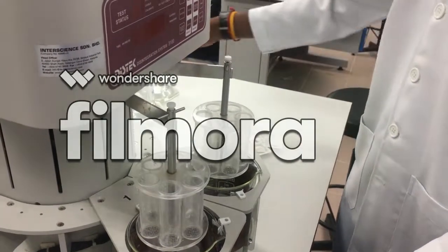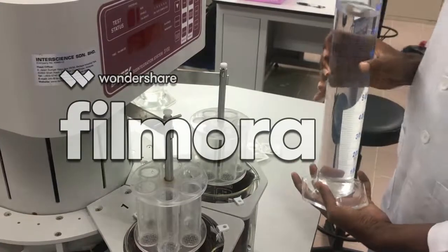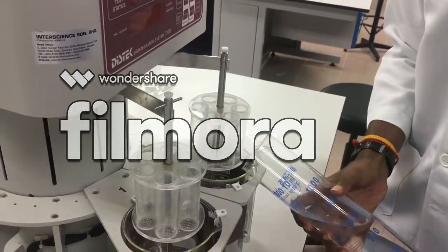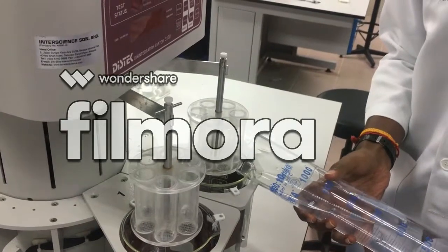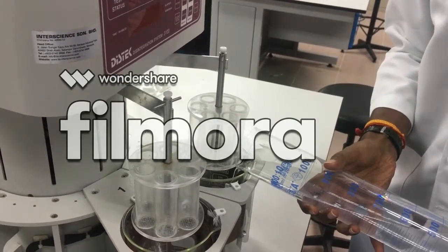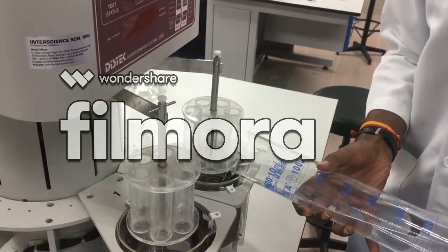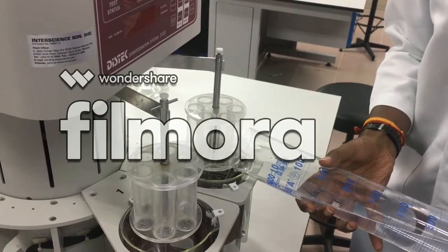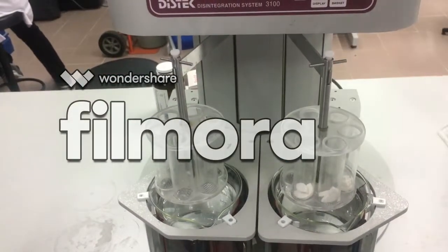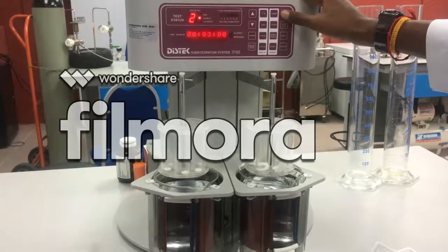First, fill a 900 ml beaker with the distilled water. Next, introduce a tablet in station 1 and station 2. Then press the start pause to start the experiment.